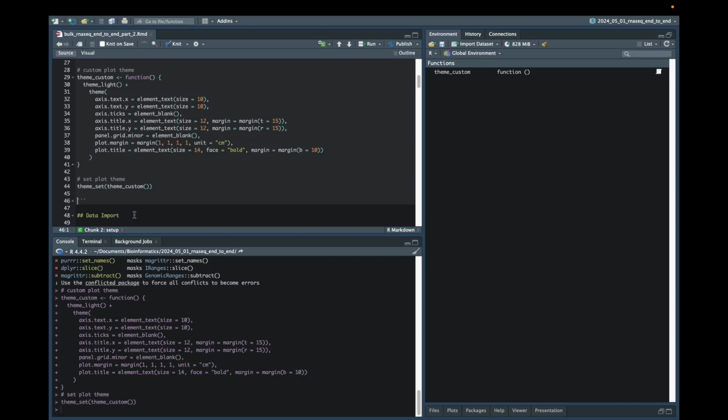The first thing that we're going to need to do in terms of progressing our analyses is to read or import the metadata and counts data that we obtained during the first tutorial into R. So when conducting any omics type experiment, such as transcriptomic profiling like bulk RNA-Seq, we refer to the descriptive data that outlines the biological and technical characteristics of the samples we've sequenced as the experimental metadata.